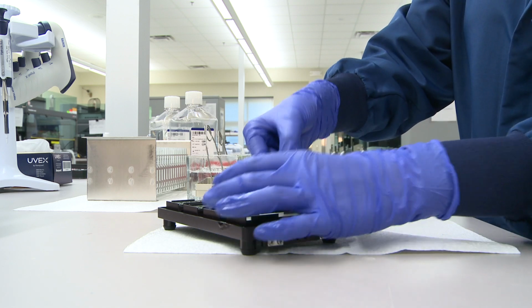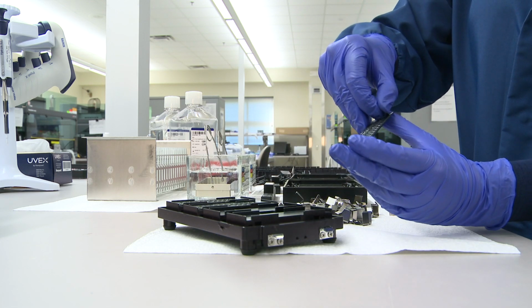Over the past few decades, scientists have perfected this amazing technology that allows us to read specific spots throughout your genome. It's called genotyping, and it starts with a chip. A genotyping chip. Unlike a potato chip, this chip is perfectly flat, rectangular, kind of like a stick of gum.